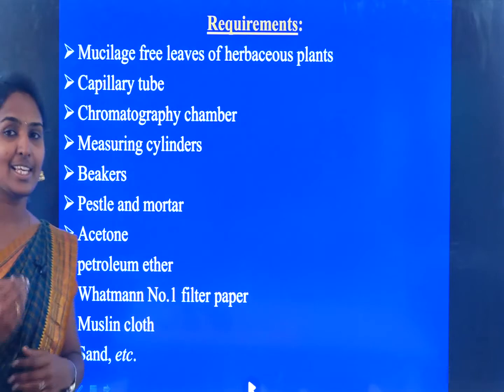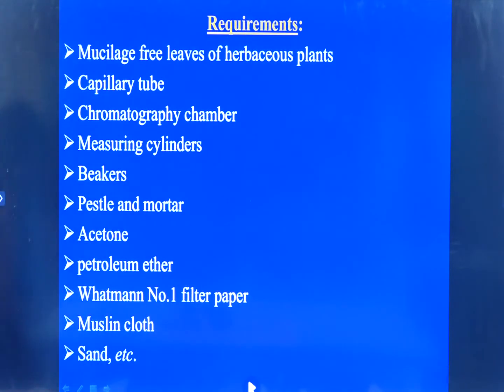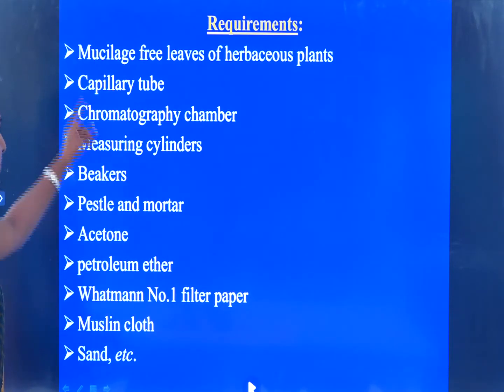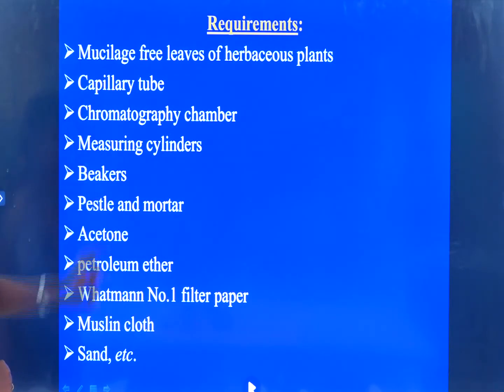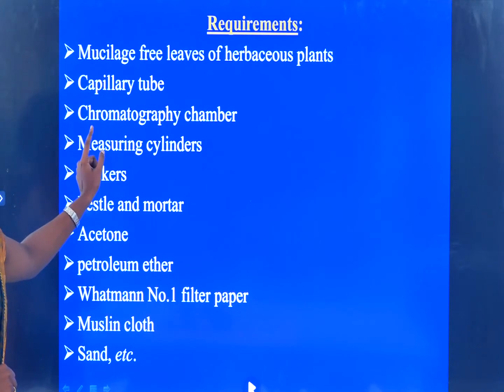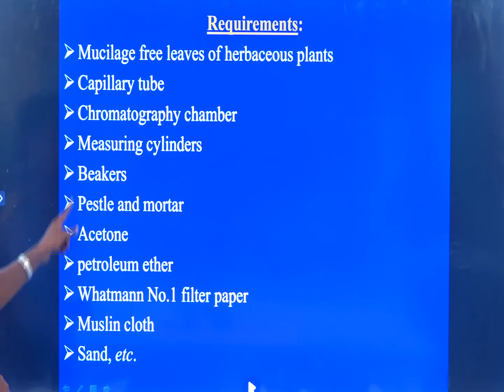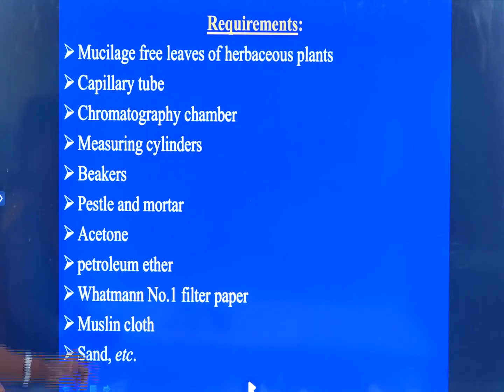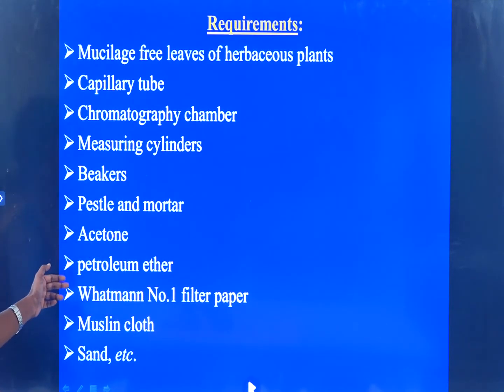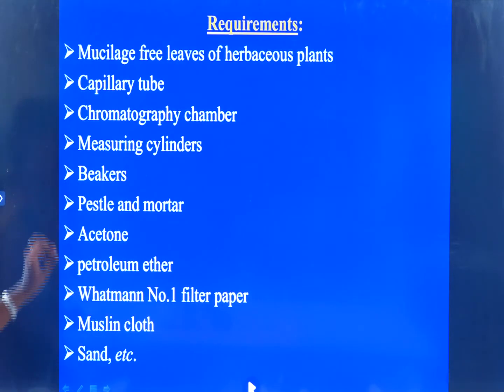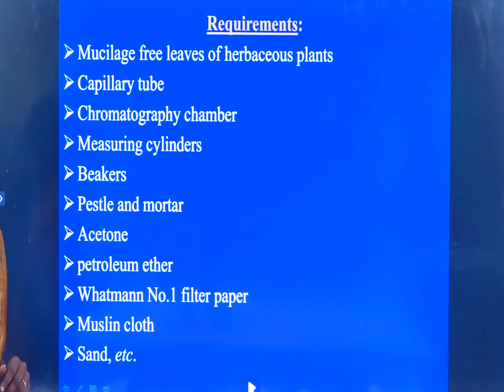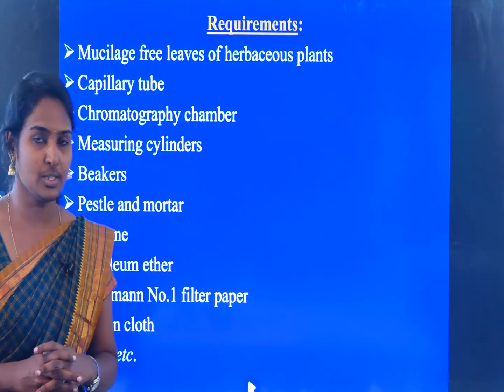For the experiment, the requirements are: mucilage-free leaves of a herbaceous plant, capillary tube, chromatography chamber, measuring cylinder, beaker, pestle and mortar, acetone, petroleum ether, Whatman number 1 filter paper, muslin cloth, and sand. These are the basic requirements needed for the paper chromatography method.